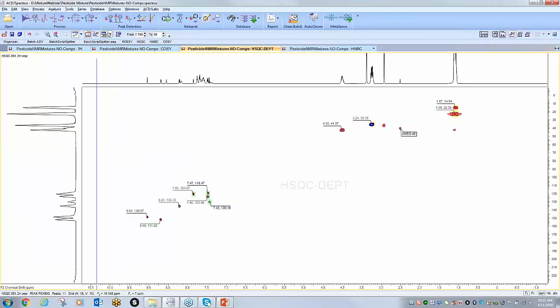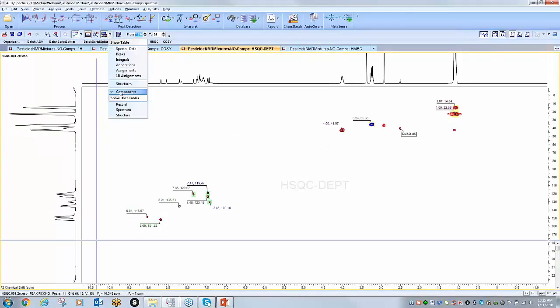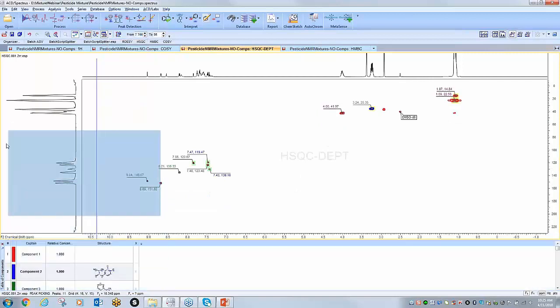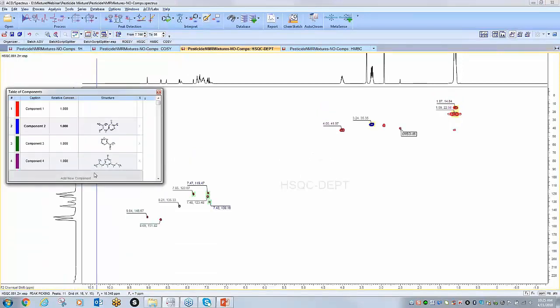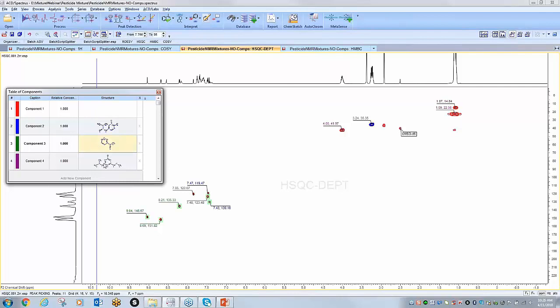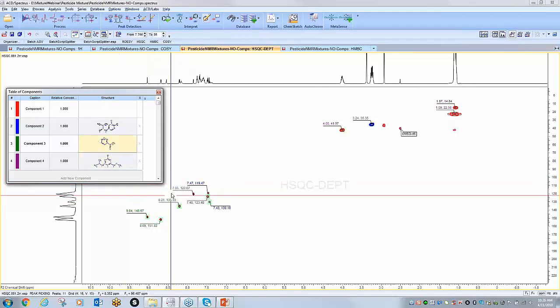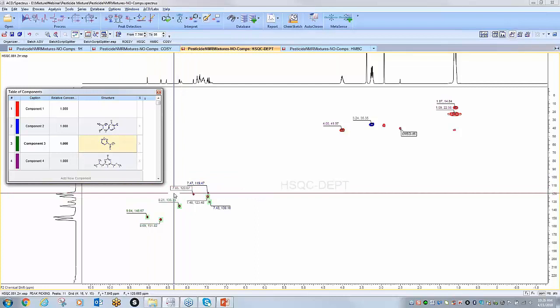So now if I look at my table of components, you'll see that the component that I'm currently selected on is actually highlighting the match, and I can go through and quickly look at the assignment quality for the structures and see which signals correspond to which component, again based off of the color coding.